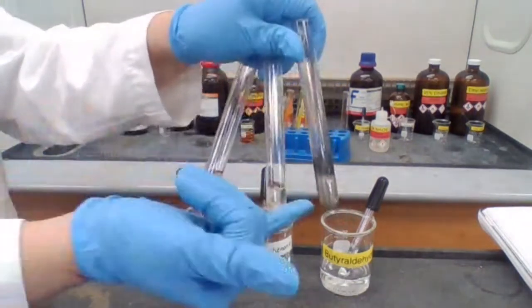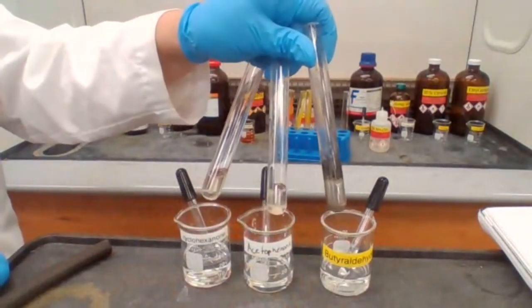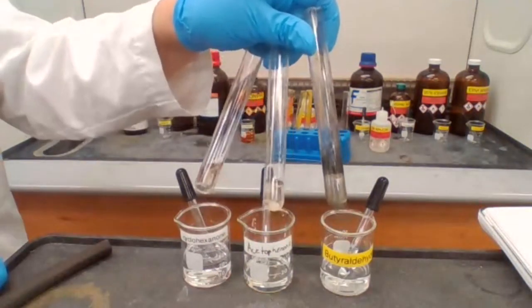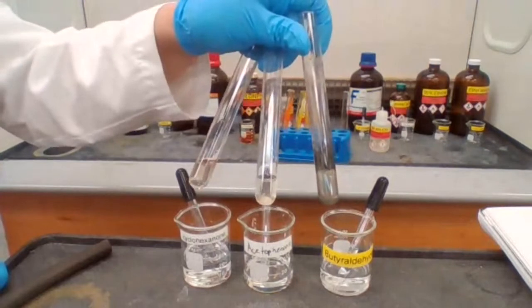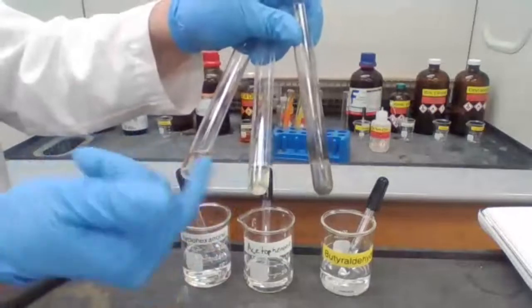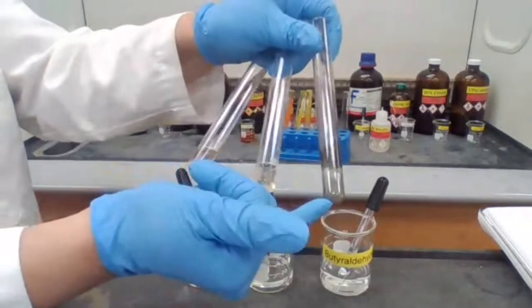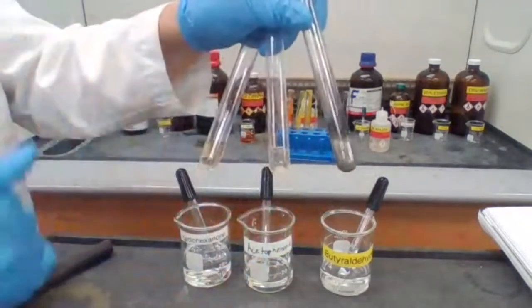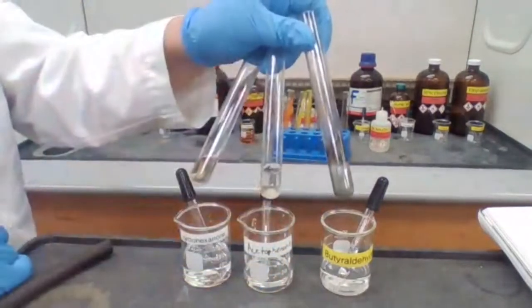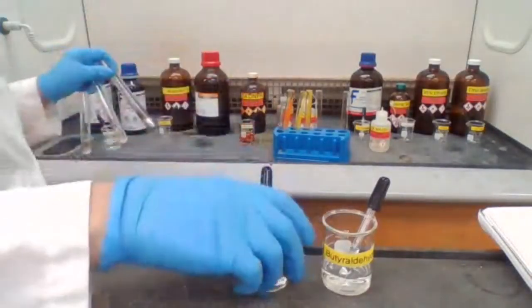Okay. Did you notice formation of the silver mirror? Yes, for test tube 3 only, because these two are ketone and only this one is aldehyde. Only aldehyde would give a positive test, ketone will give a negative test. A black precipitate or silver mirror is the indication your compound is aldehyde. Okay, I hope you all took your screenshot.